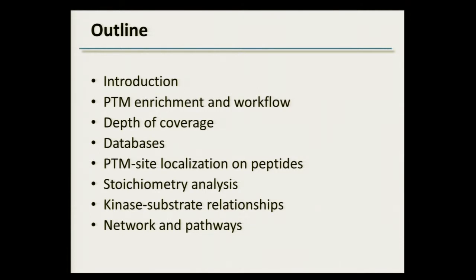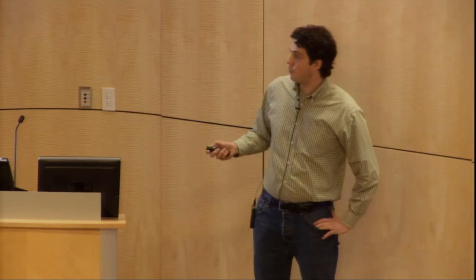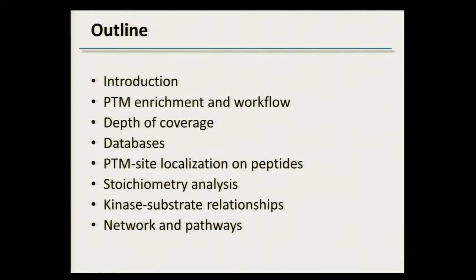So the outline for this talk is that first I want to give you a short introduction, then continue with how we do PTM enrichment and what our current workflows are. Then I want to show you what depths of coverage we can achieve with our methods, and in what publicly available databases all those global post-translational modification data is currently collected. Then how we do PTM site localization on peptides, how we analyze stoichiometry of protein post-translational modification, and later also how we elucidate kinase-substrate relationships, and how we do network and pathway analysis.